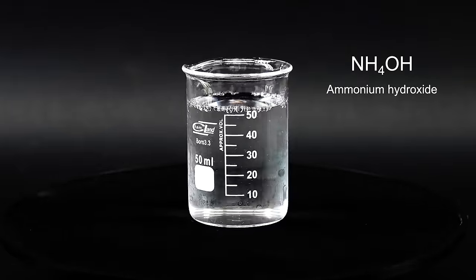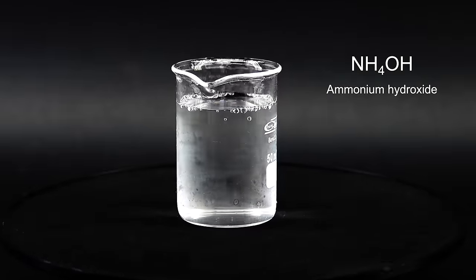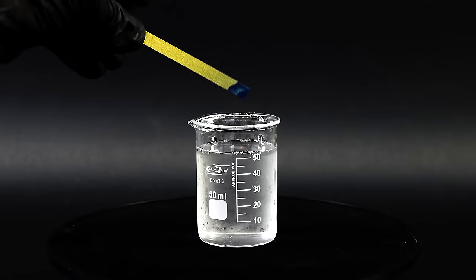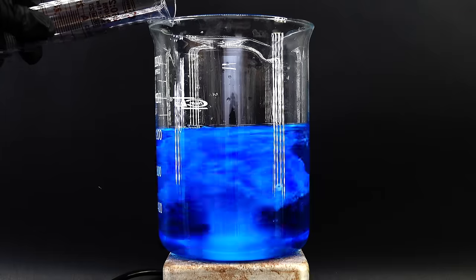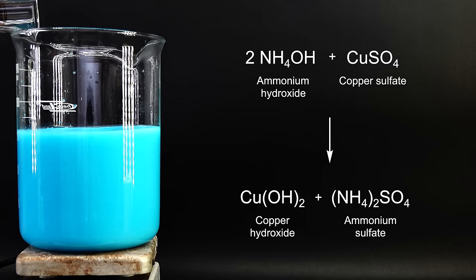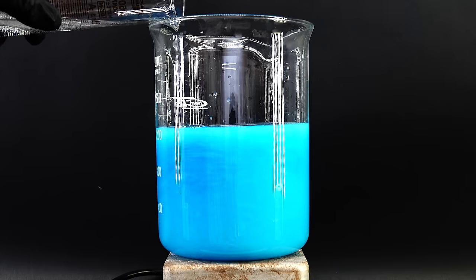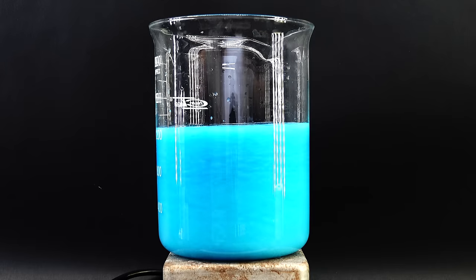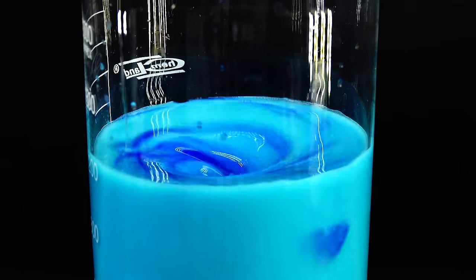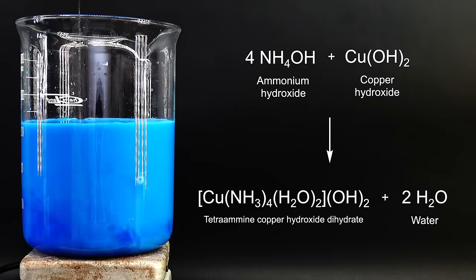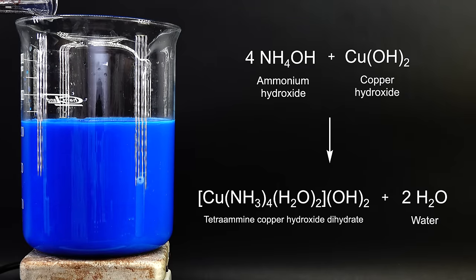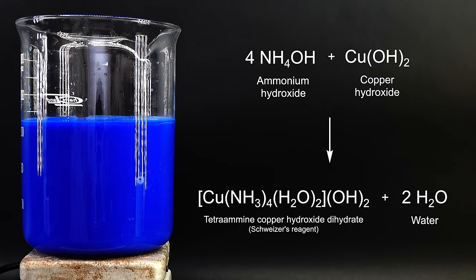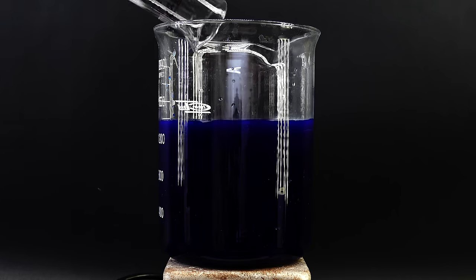There are many available concentrations you can buy, and the highest I could get is 25%, of which I had to use 110 milliliters. Much like sodium hydroxide, this ammonia solution is quite basic, and upon adding some of it to the copper sulfate beaker, a ton of insoluble copper hydroxide precipitates. It already looks better than the blue jelly from before, being this sky blue suspension, but it still isn't what I want. To convert it into its most stable form, I have to dissolve it and precipitate it again, and the dissolving step can easily be done by adding in more ammonia. It has a quite special relationship with copper, since when there is enough of it, it can form this deep blue water soluble complex that actually is Schweizer's reagent. Because I want to make it pure, I can't really use this one to dissolve my cellulose, and instead have to revert it back to copper hydroxide, which I can purify much easier.